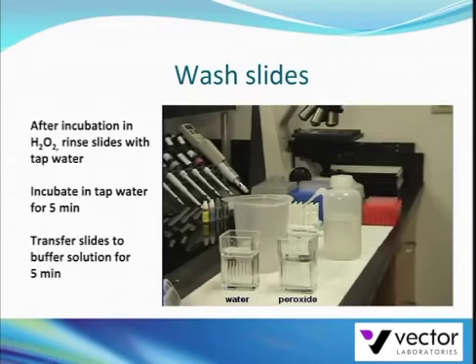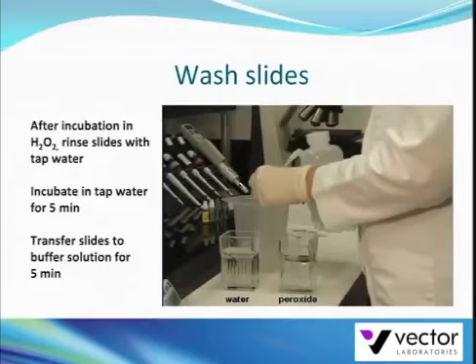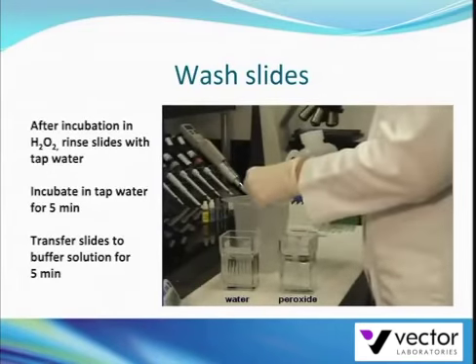After 5 minutes, gently rinse each slide with tap water and incubate in tap water for 5 minutes. Then transfer the slides to a buffer solution.